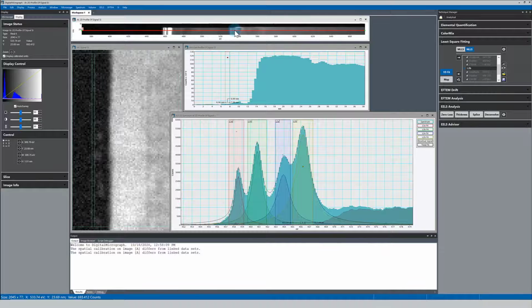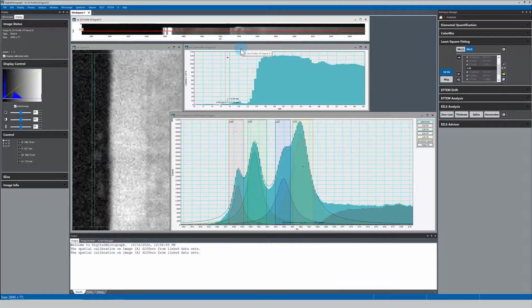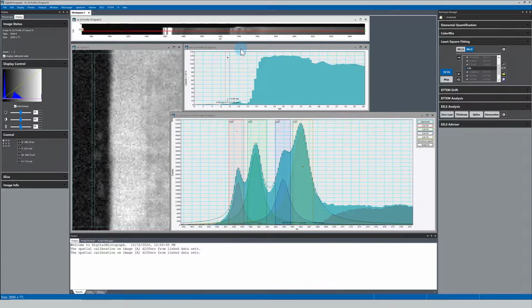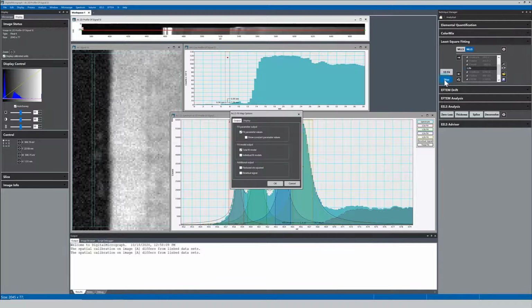I'm just using the up and down keys at the moment with this picker ROI or picker region selected and going back and forth over the STO BTO interface and just seeing that the fit doesn't do anything really stupid for L3. Looks fine.